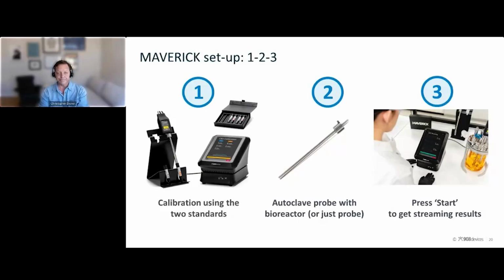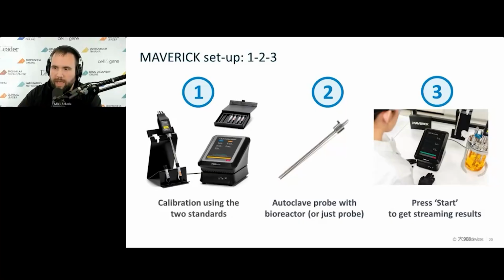Yeah, good stuff, Chris. I'm not sure you could have made it any easier with that. That's perfect. All right. So you guys mentioned this once or twice in the presentation, but a few people asked it as well. Is the Raman spectral data available if I wanted to do additional modeling? Is there an easy way to access it?